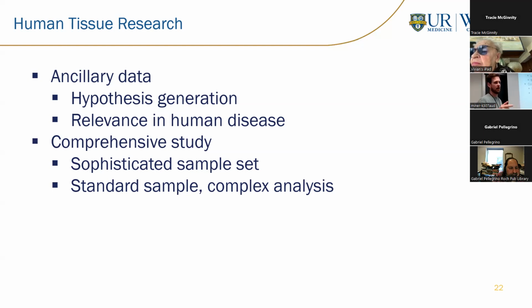For a prospective collection, our patients are consented prior to the resection procedure. At least with our Indivimed or our Wilmot Cancer Library partners, they'll use Surgery Snapboard to identify, okay, here's an interesting case coming through. We need to intervene, try to consent this patient beforehand. And then the day of the surgery, if that patient was consented, their staff members will monitor the surgery schedule, head down a bit early into the OR, and then take the tissue back to surgical pathology. After the pathologists take what they need for clinical diagnostics, they set aside what's allowable for research, and we go from there. Them being in the OR really expedites the process and saves some of that ischemia time, rather than relying on the clinical routine of bringing those tissues up.